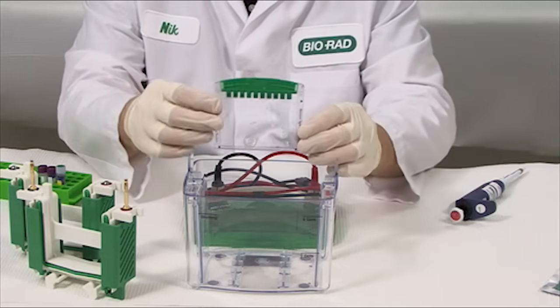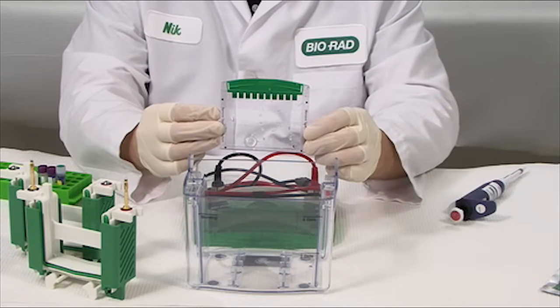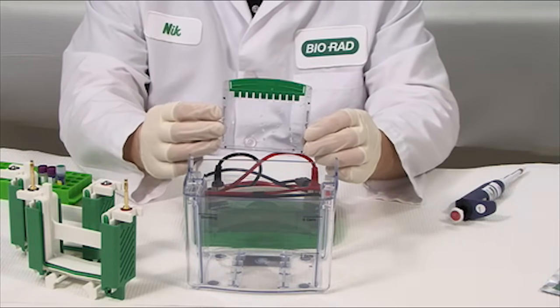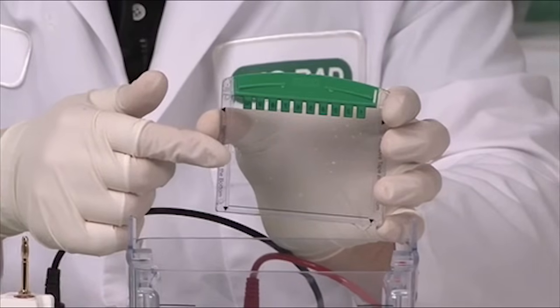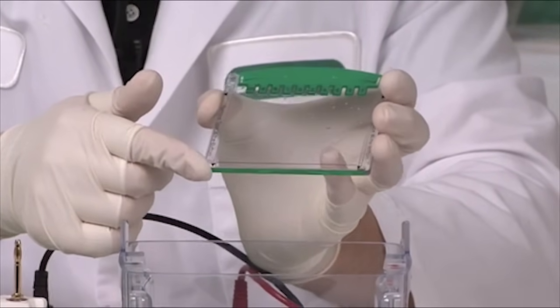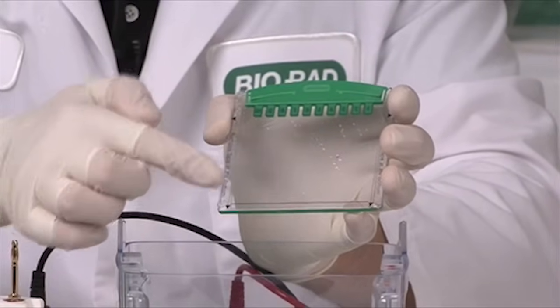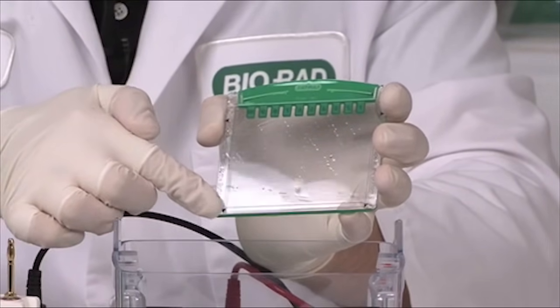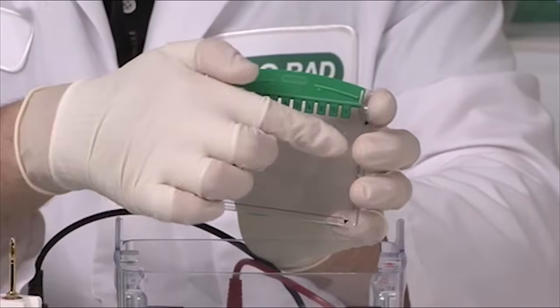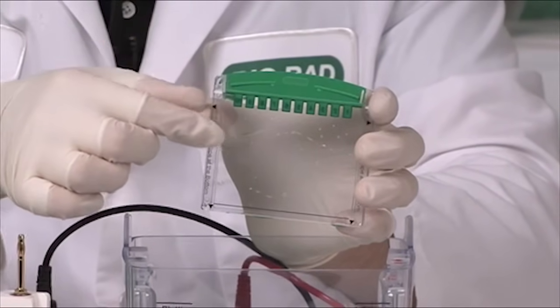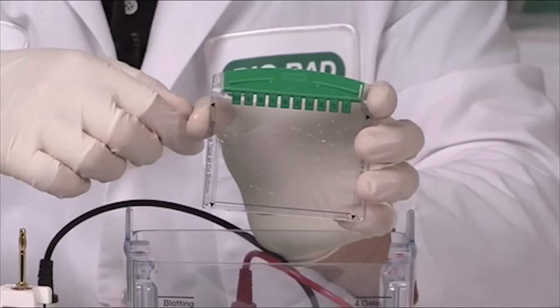The TGX gels have several features that were added based on input from you, our users. The TGX gel is in an all plastic cassette which has a bottom opening design which allows for increased resolution from your run. There is a reference line to help you monitor your electrophoresis run and the wells are both outlined and labeled for easy sample loading and sample identification.